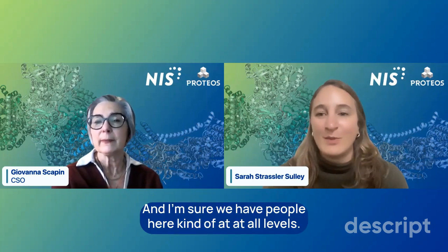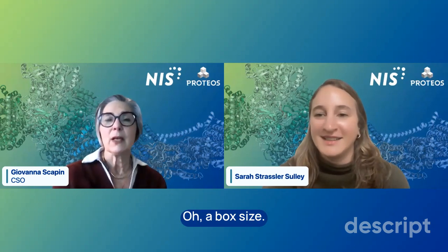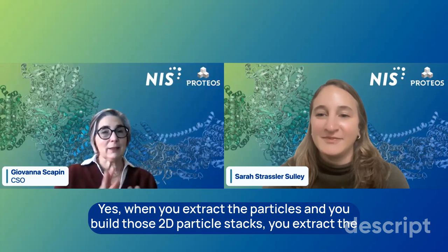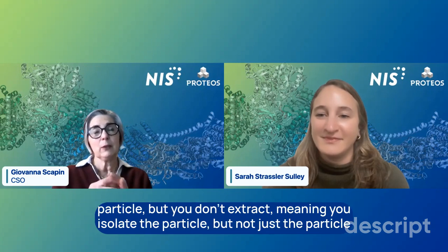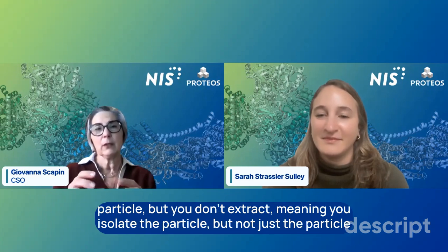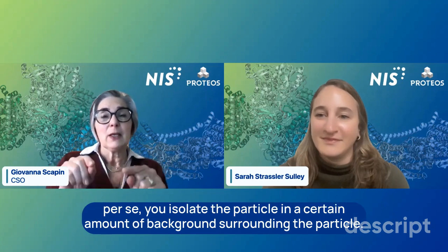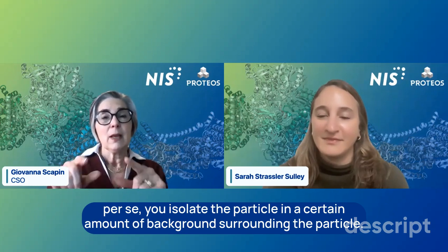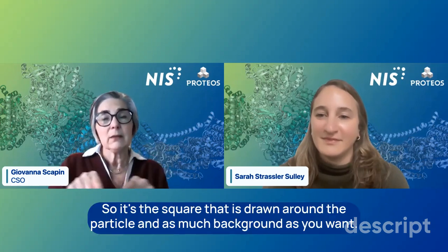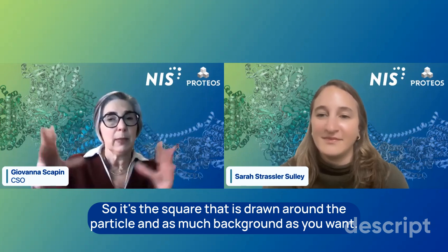And I'm sure we have people here at all levels. Do you mind touching on what is a box size? Oh, a box size. Yes. When you extract the particles and you build those 2D particle stacks, you isolate the particle, but not just the particle per se. You isolate the particle in a certain amount of background surrounding the particle. And that is the box. So it's the square that is drawn around the particle and as much background as you want.